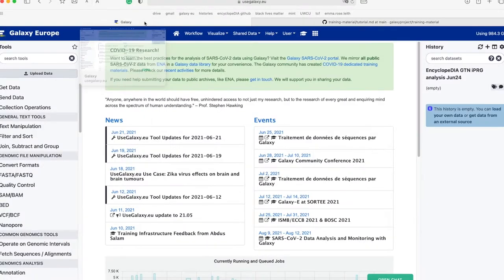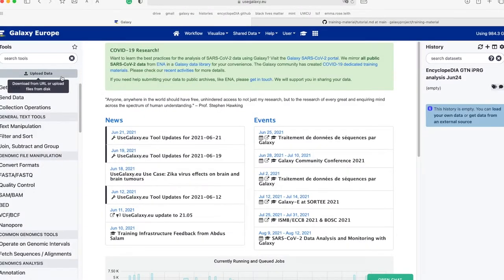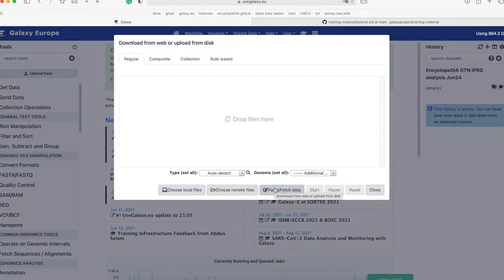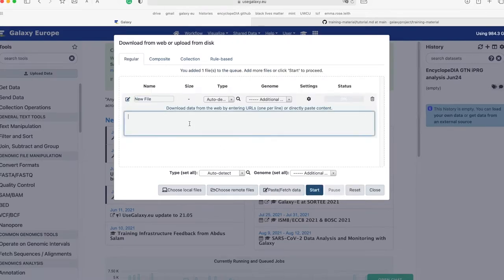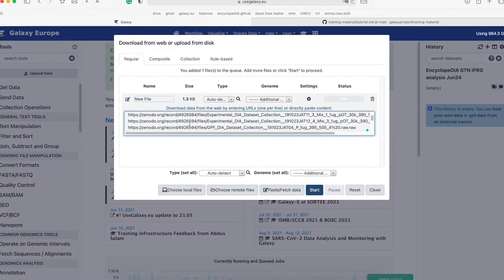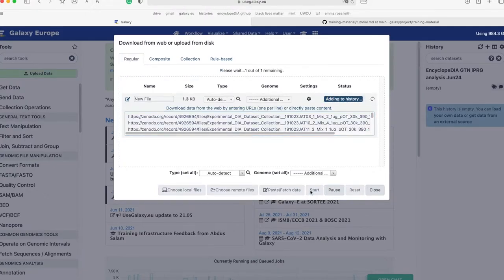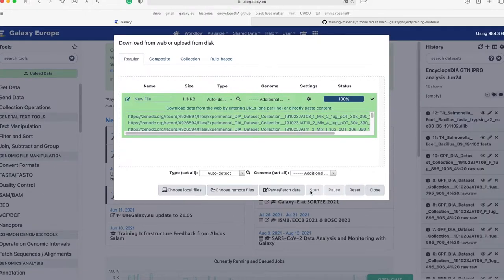Then, go back to the Galaxy history that we created before. Click the upload data symbol on the left panel of the screen, and at the bottom choose 'Paste/Fetch Data.' This box will pop up, and at this point you can paste the links that you previously copied from the Encyclopedia GTN. Then click Start, and the files will begin to upload to your history one by one automatically. This method is much faster than downloading the files onto your computer and then uploading them.